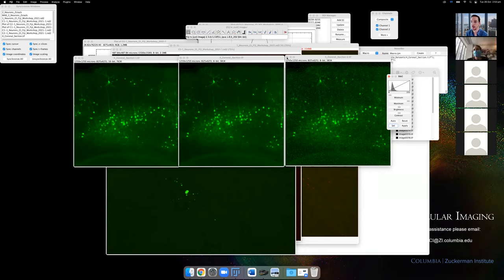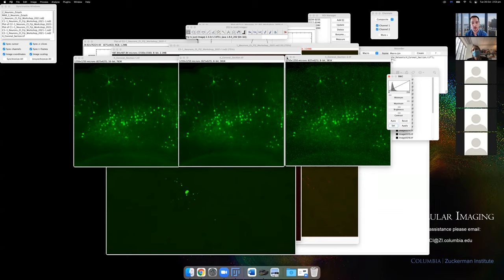Filtering would be done for presentation or segmentation purposes, but your actual intensity measurements should be made on the unprocessed image. Take into account background by measuring near a cell. Filters are used to better isolate cells, axons, or dendrites — whenever you apply a filter you're losing information, but hopefully you'll see the structure more clearly. All final measurements should be made on unaltered data.